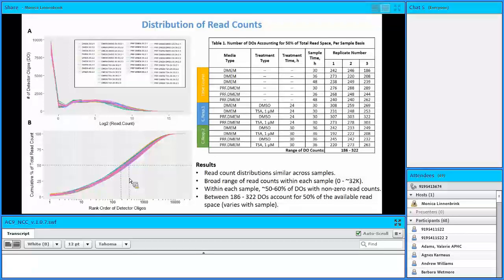that you have. So that really limits your ability within that other 50% to look at low abundance transcripts without some additional attenuation. So the next question we had to have, given this observation, we can answer the first question, yes, we felt that we needed to attenuate some additional genes in these samples. So how do we go about identifying our attenuation set?